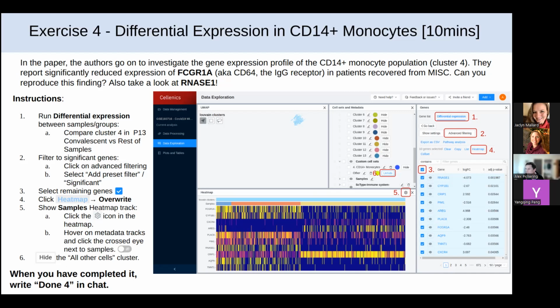We have a question in the chat. Martin was wondering about trajectory analysis on the plot section, whether it's also under development. Yeah, I would definitely say there are additional features that should be added to that. It's fairly rudimentary right now.